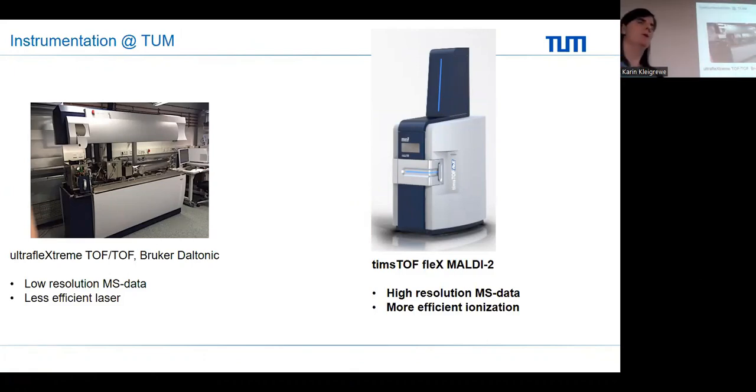And if you work with mass spec data, you can basically conclude from the M/Z ratio the sum formula, and the possibilities of metabolites or lipids are much fewer compared to when you have only 1 digit. Then you get some leads and you need to double check if it's correct. And this laser is less efficient compared to the ones which are out there today.